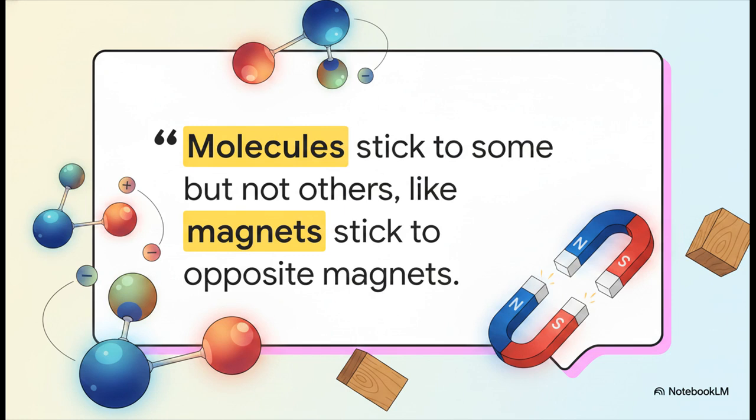Think about the molecules inside living things almost like a giant bucket of mixed magnets. They stick to some very specific molecules, but ignore others entirely. Exactly the way a magnet snaps right to metal, but doesn't do a thing to wood or plastic. In the lab, we actively leverage these natural, highly specific, and reversible biological interactions to hunt down and isolate our exact target molecule from that crazy complex mixture.